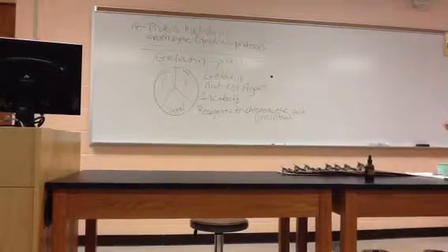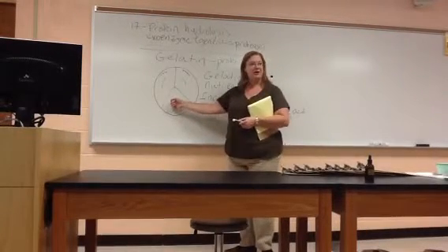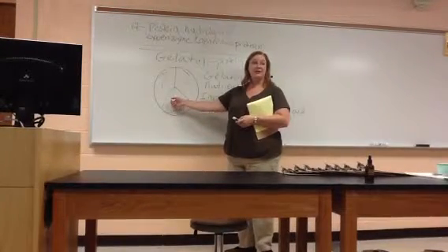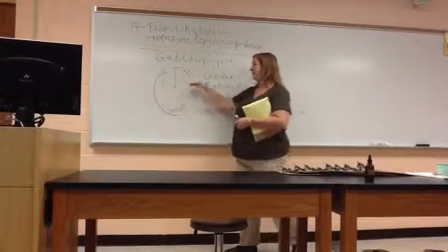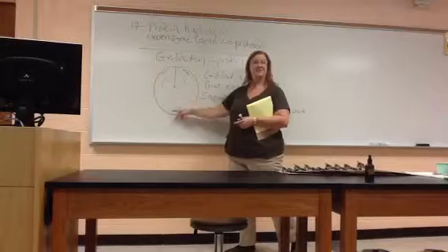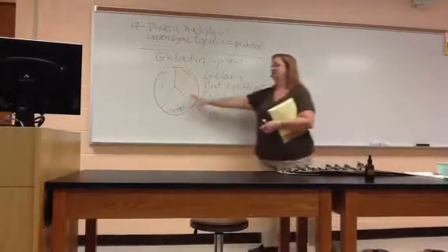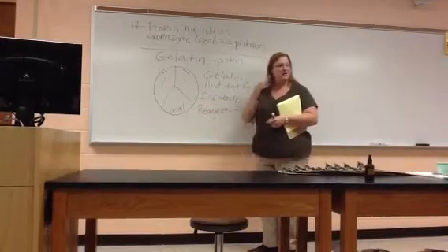So when we come back next time and we add trichloroacetic acid, what's going to happen in the control section of the plate? Nothing. It's going to clump and turn cloudy and white, right? Because it's got gelatin protein in it. There's no bacteria in there to break it down. So when we add the reagent, all the protein in that section should clump up and turn cloudy and white.